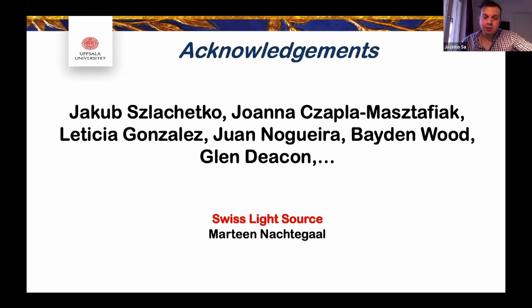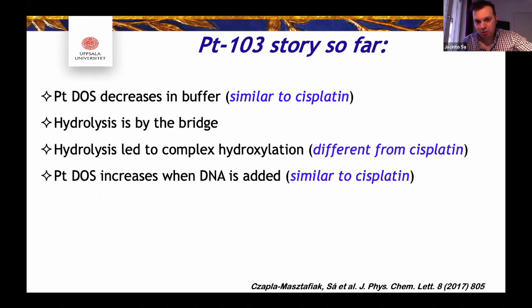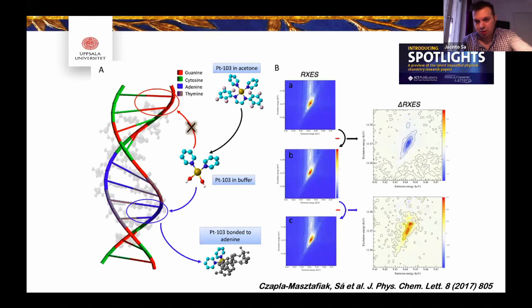Yeah, we do it a little bit the other way around. We measure the resonance XAS and the RIXS and look for where the differences are. And we didn't see so much difference in this case on the emissions. So if you look at this one, this is actually the delta RIXS, basically the difference between the two maps. And you see that it's primarily at the cut of the HERFD that you see the difference. So what we did is then we analyzed primarily the HERFD.